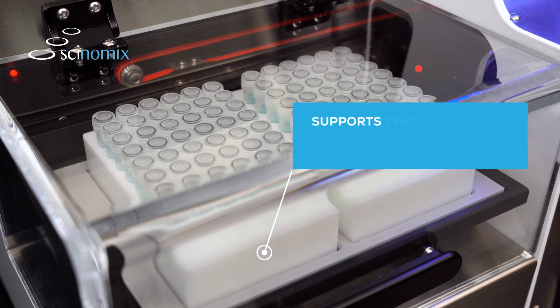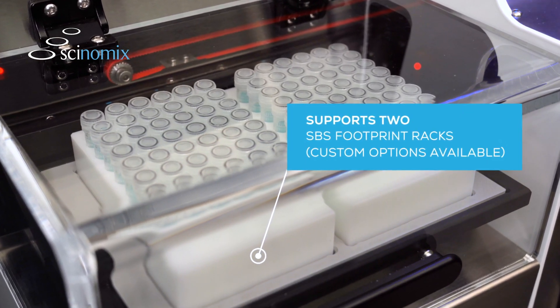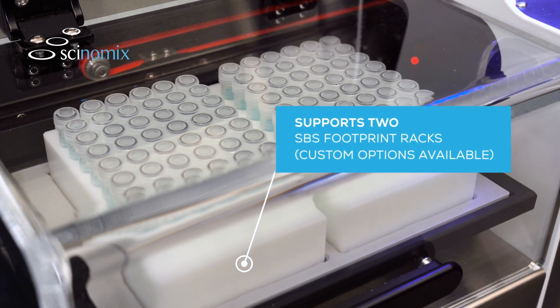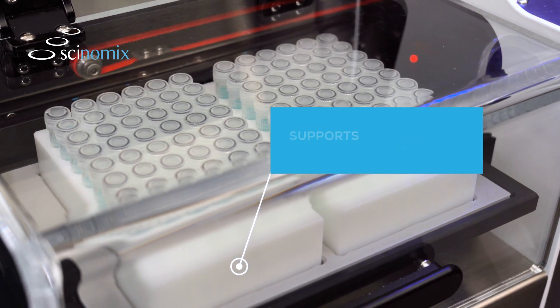RapidCap2 is designed to hold two SBS footprint tube racks. However, Synomics can custom manufacture rack adapters and custom racks to meet your unique specifications.